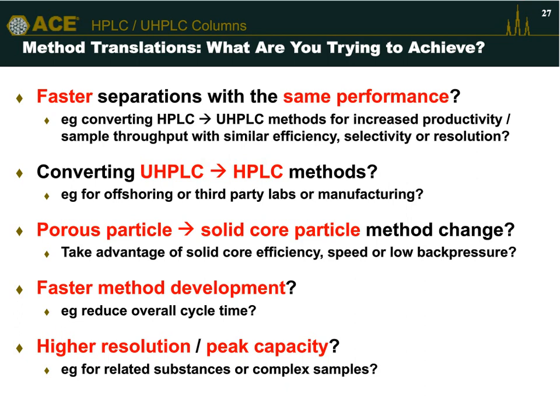Do you want to change the particle platform? Do you want to change from a porous particle to a solid core particle? How do you do that? What are the things you need to think about?